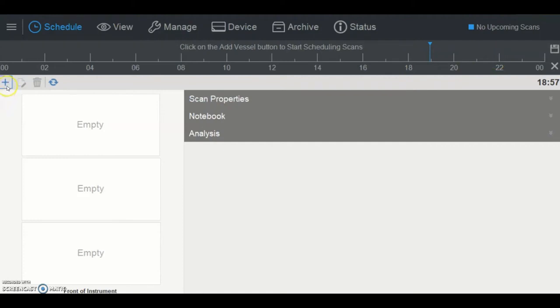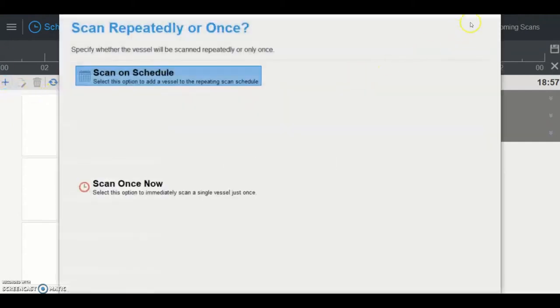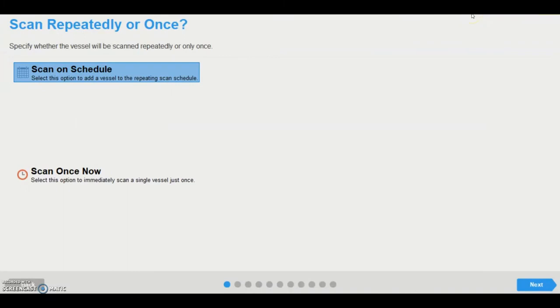At various points in the Incucyte software, pop-ups will appear giving the user additional information about different elements within the graphical user interface. This will open up the guided interface containing 11 steps, where the user can check the progression at the bottom of the screen.